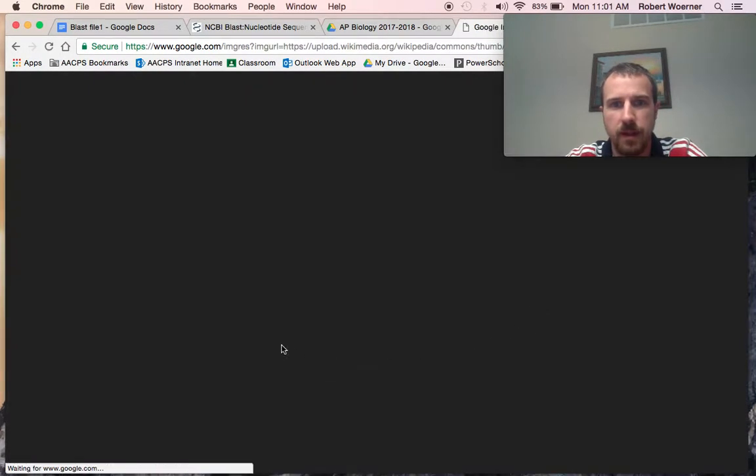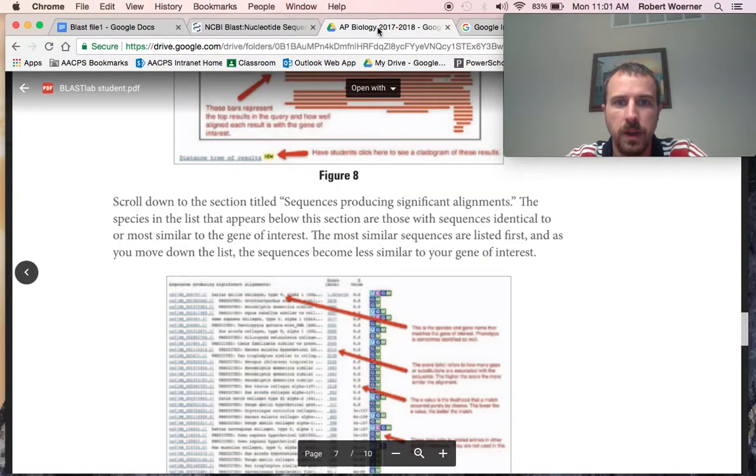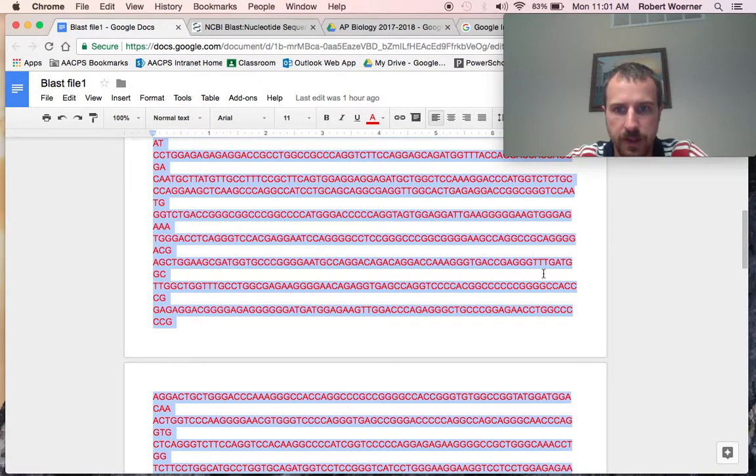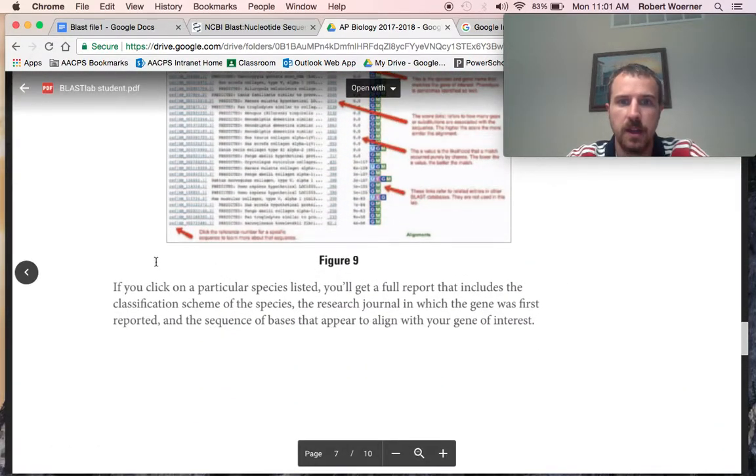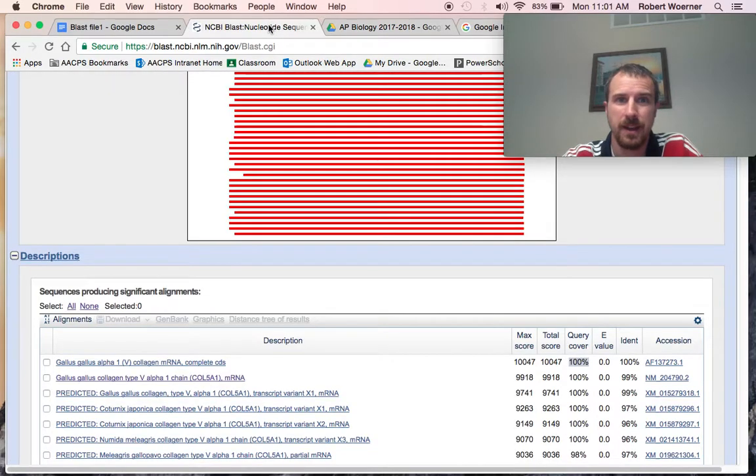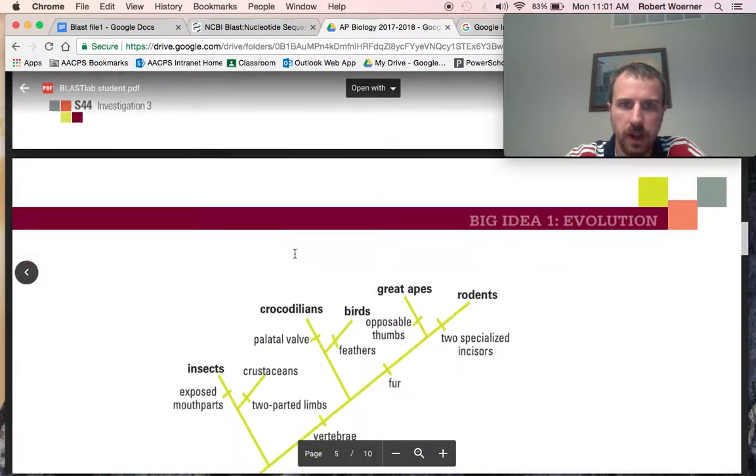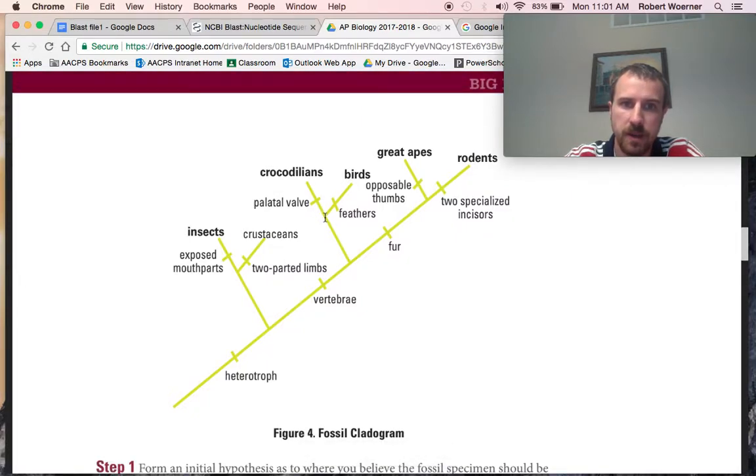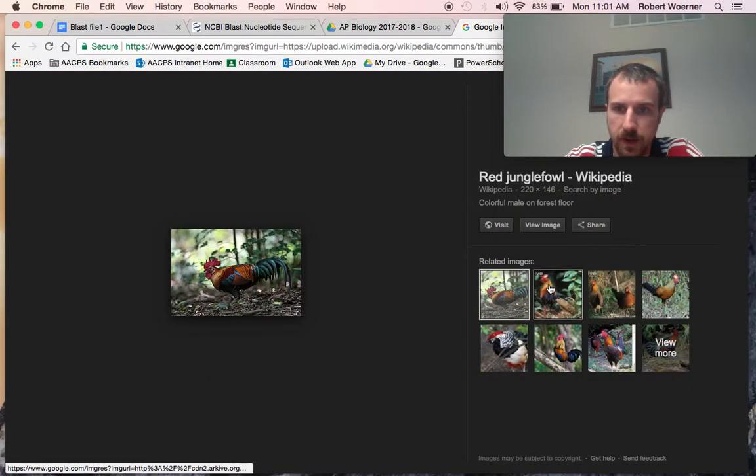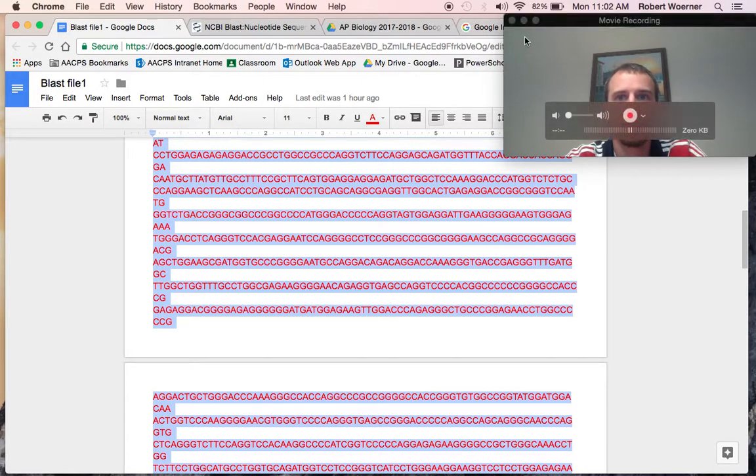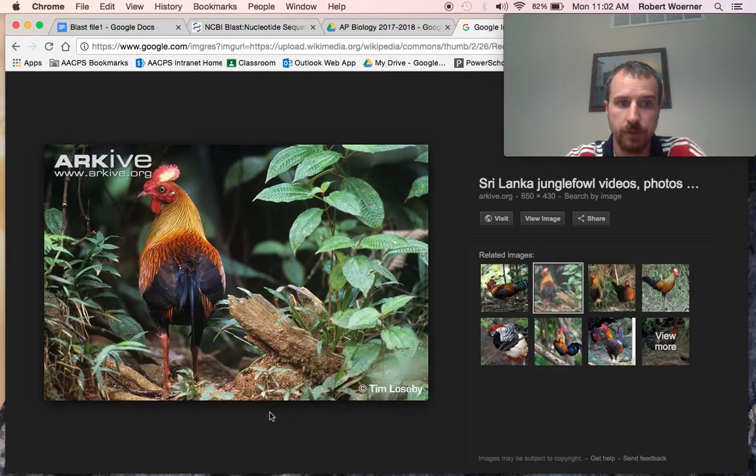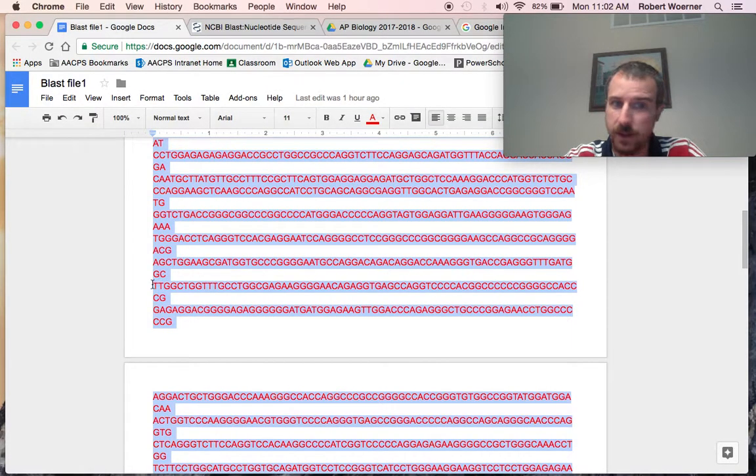It's a red jungle fowl. We'll click on a picture. It looks like a rooster. So, we know that it is a bird. Our DNA sequence is the exact same as that bird. That means that once we've gotten all four, we can pretty much determine where it is. If we look back on our lab data, back to our cladogram, we said our creature was very similar to birds. So, it's very similar to the Gallus gallus. If the Gallus gallus has the exact same DNA sequence as our fossil, that means that the Gallus gallus was related to our creature. They came from the same organism. Our fossil passed down its DNA over many generations to help that creature, or help the Gallus gallus.